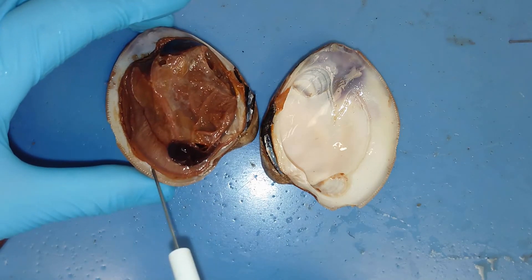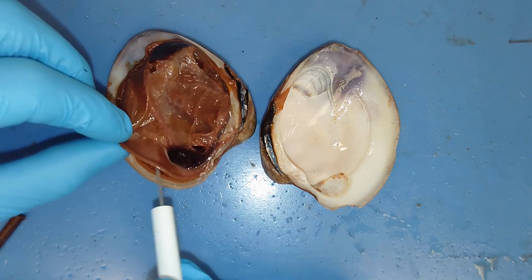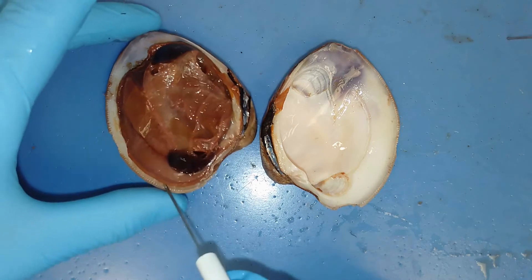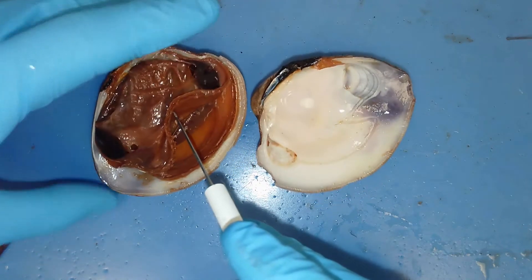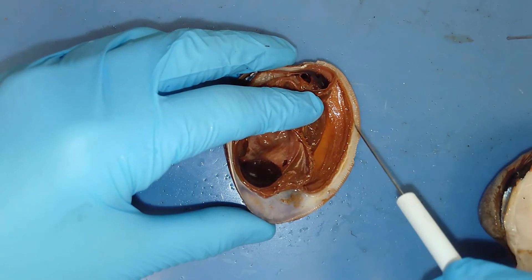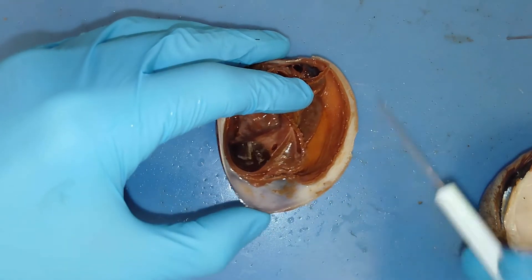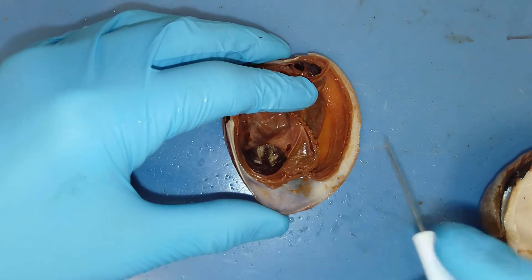This thin membranous structure right here — this is the mantle. All mollusks will have one of four things: a mantle, a foot, gills, and a visceral mass. The mantle is what is excreting that calcium carbonate. If you look closely, I've peeled up one side of the mantle — this mantle is attached right at the very edge of the shell, secreting calcium carbonate from this thickened layer. Over time, this outer layer expands from the layers of calcium carbonate that this mantle is applying.